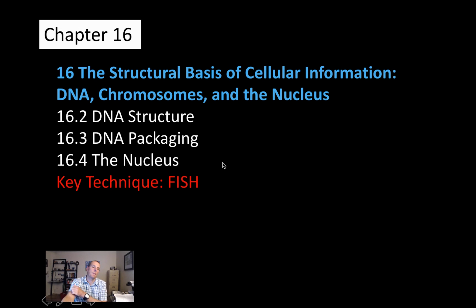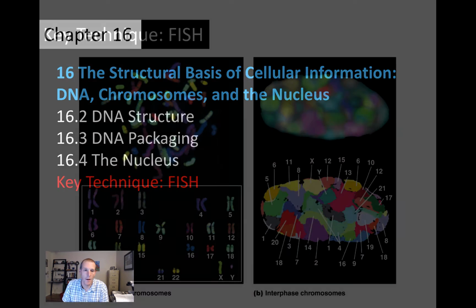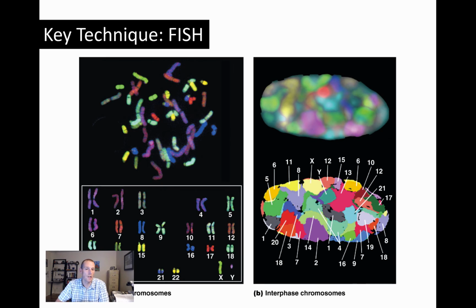Welcome to the end of chapter 16. So what we're going to look at here is a technique called FISH. It's a technique for painting chromosomes in different colors in cells. And that sounds a little weird, but this is the kind of thing you can achieve.